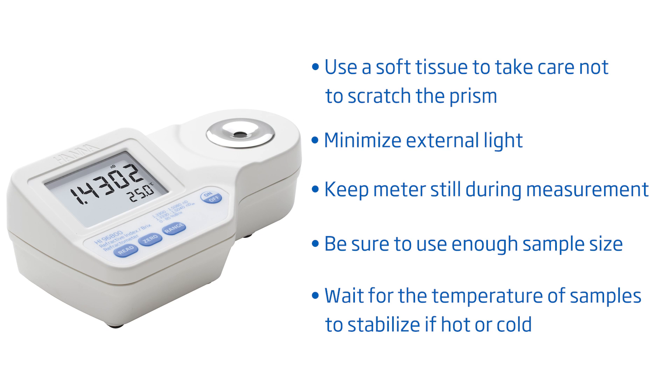To get you started right away, here are some tips to follow for best results. Take care not to scratch the prism. Minimize external light. Don't move the meter during measurement. Make sure to have a sufficient sample size and no bubbles on the prism. Wait for the temperature to stabilize if your sample is hot or cold.